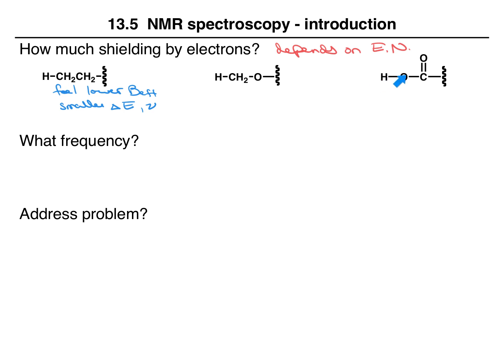The electrons are not shielding the hydrogen nucleus, so the B effective is almost the same, we can think of it, as the applied magnetic field. So it's feeling a really big magnetic field, which leads to the largest delta E and the largest frequency. All right, now considering these three different types of hydrogens, here we have the smallest energy gap, medium, and the largest energy gap.